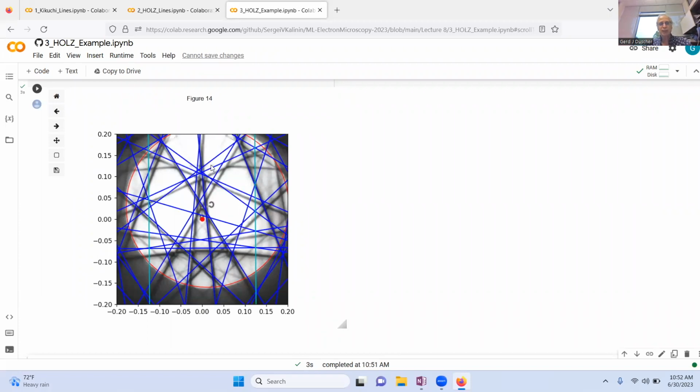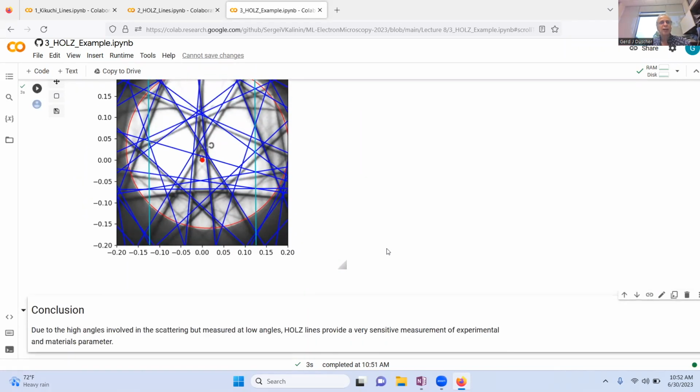So it's one of these techniques that is super precise and, as you see, relies only on kinematic diffraction and therefore only on trigonometry, which in the matrix implementation of trigonometry in NumPy is directly available to you through PyTemlab.